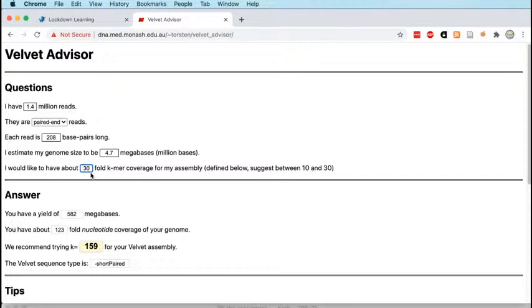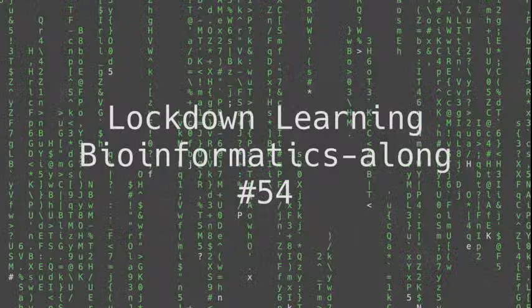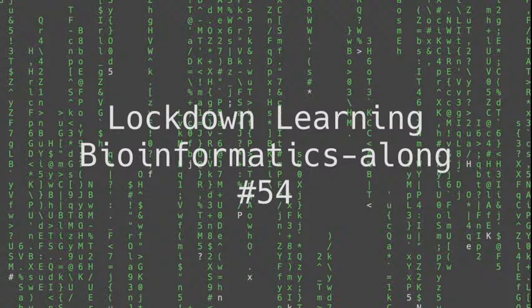but you can vary this, and with the assembler that we're going to use, you can use multiple values of k to test different assemblies, essentially, and that means that you don't necessarily have to just take one value here and use that as the value across in your experiment. You can actually pick more than one and use multiple values of k should you so desire.